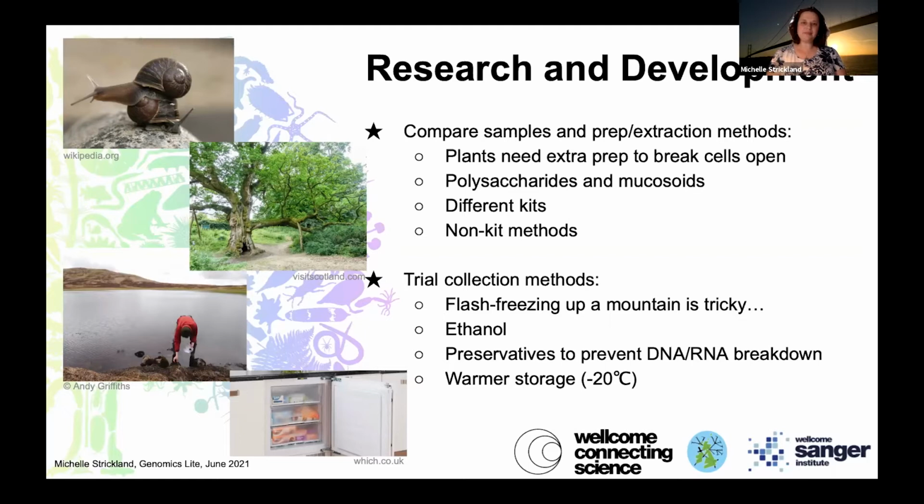So I guess it's probably more to do with how well it's been stored rather than actual age, right? Because a sample that's a few days old but hasn't been preserved is probably worse than a year-old sample that's been in the freezer. So it's probably a trade-off between preserving and age. Yeah, exactly. And I think there's probably a link with the size of the sample as well. Something that's much larger is going to defrost or thaw much more slowly than something that's very small. And I talked a bit about the weighing and the dissecting of samples. All the time those samples spend out of the freezer, there's a risk that they get defrosted, a risk of damage to that DNA. So there's as much about the handling in the lab as there is about the storage.